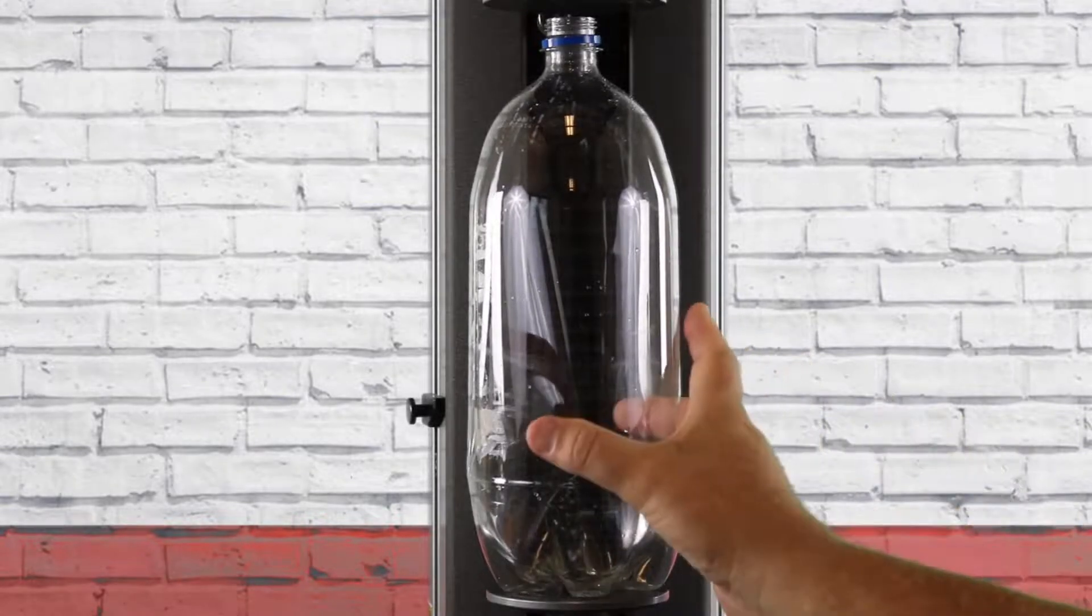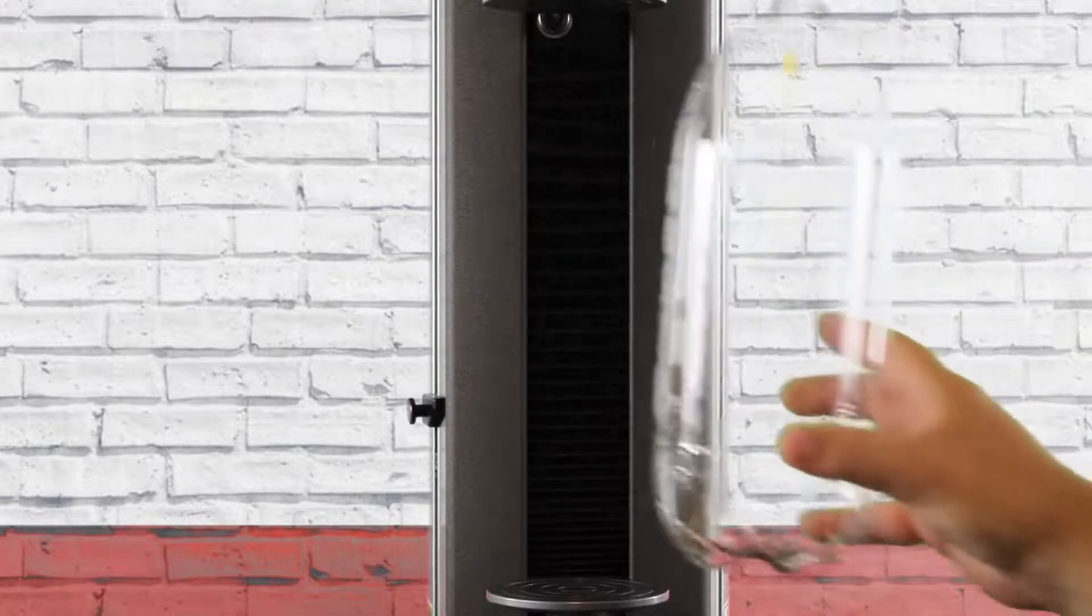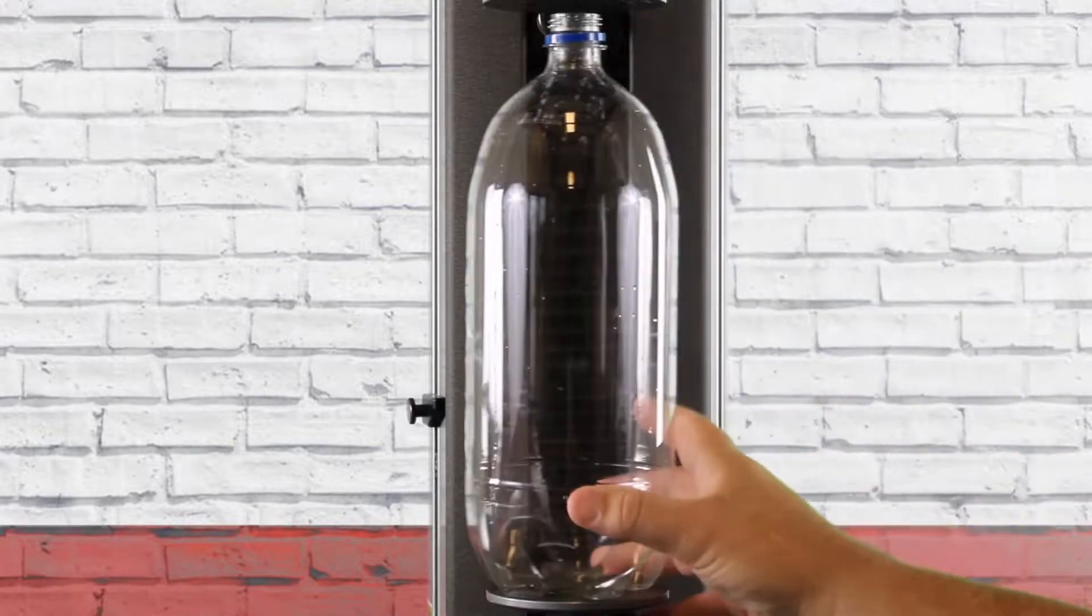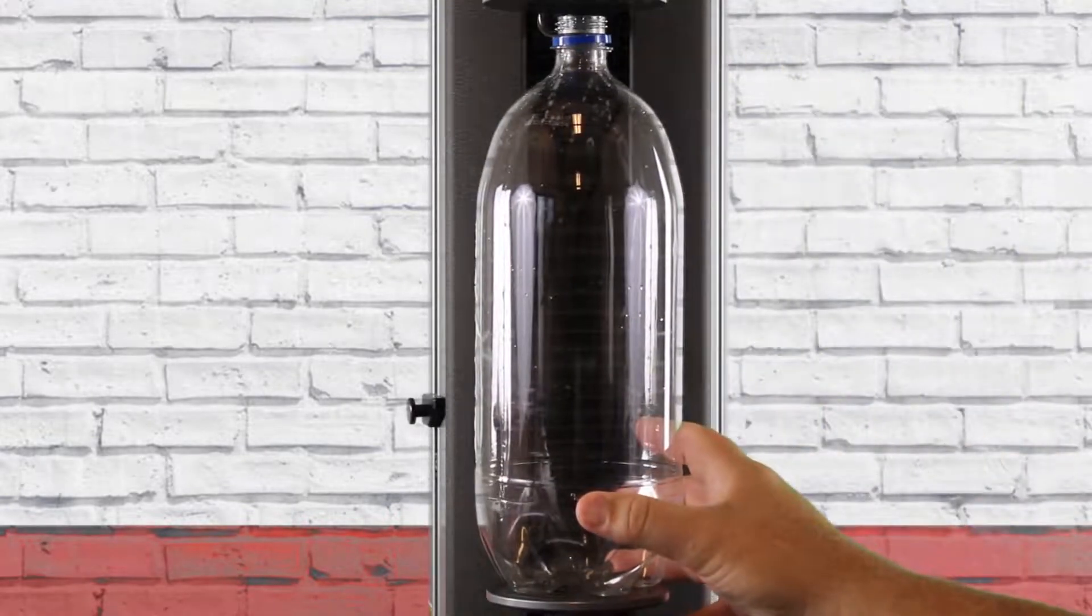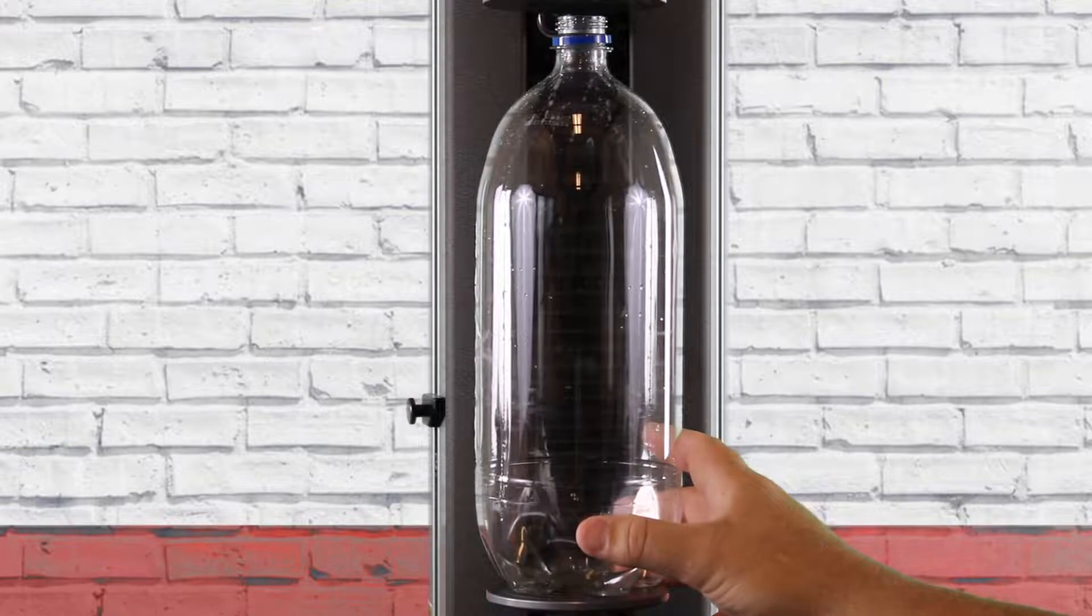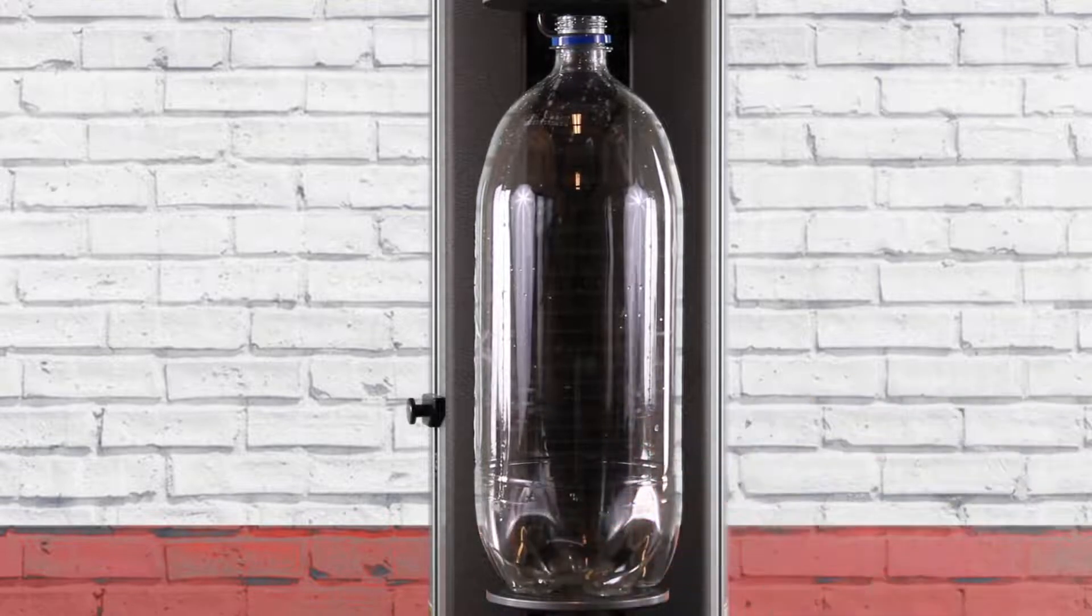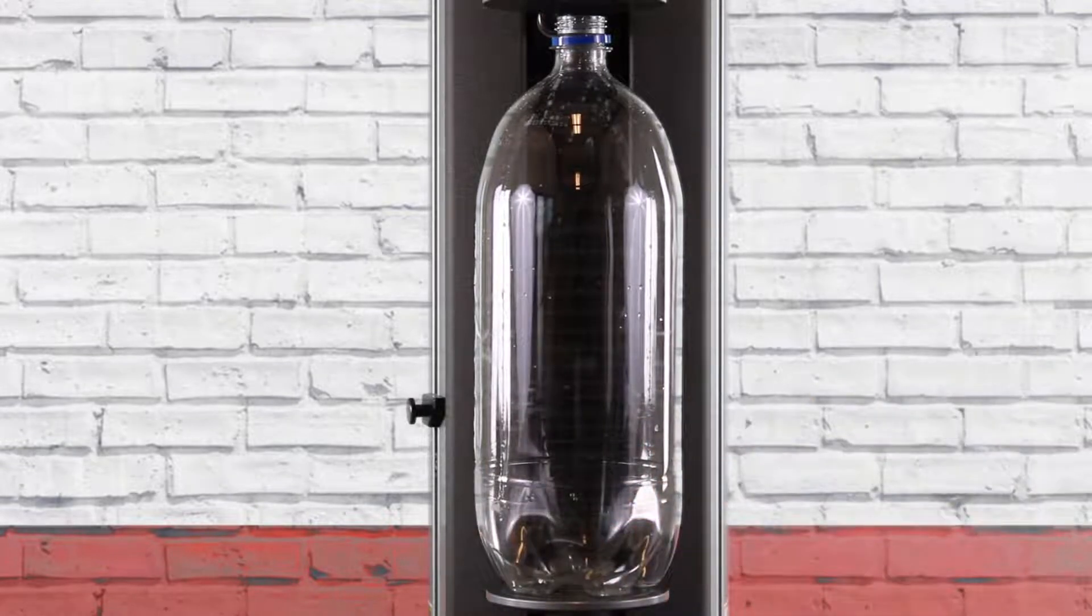Let's go ahead and reset the bottle for one more test, so we'll put it in there and let's do one more.